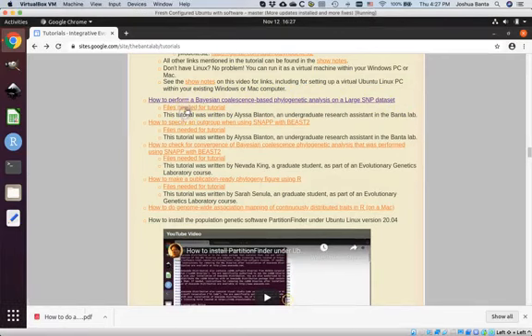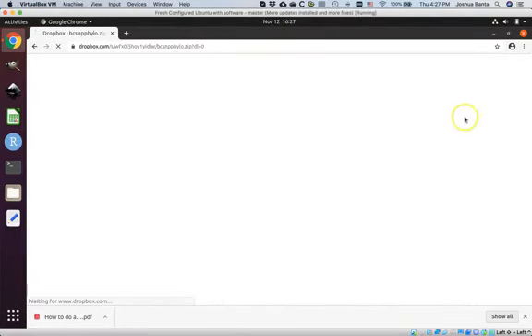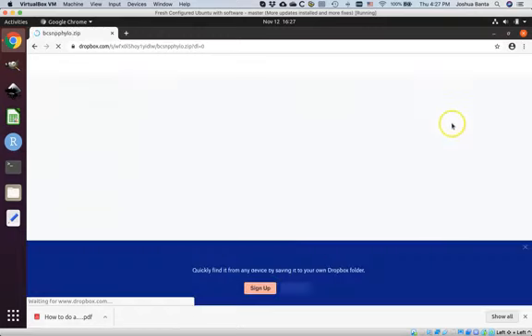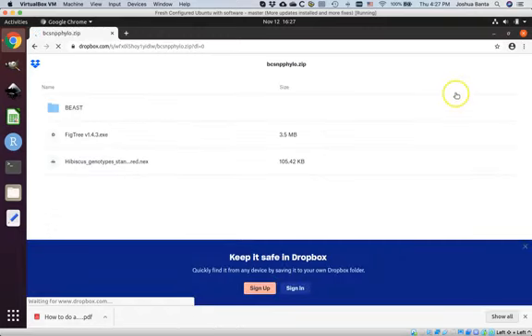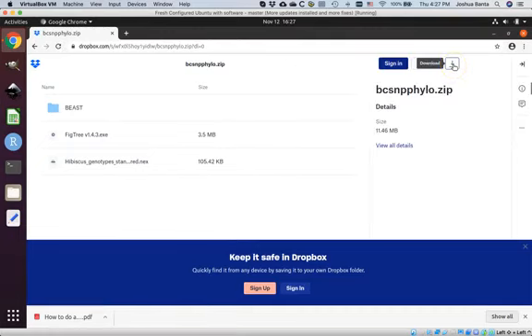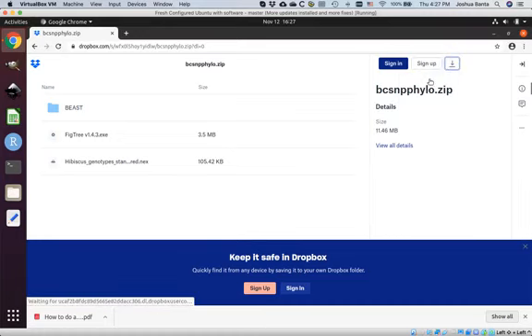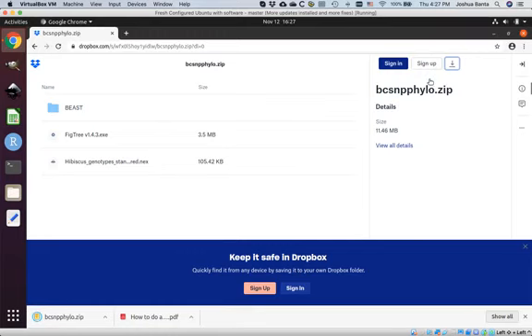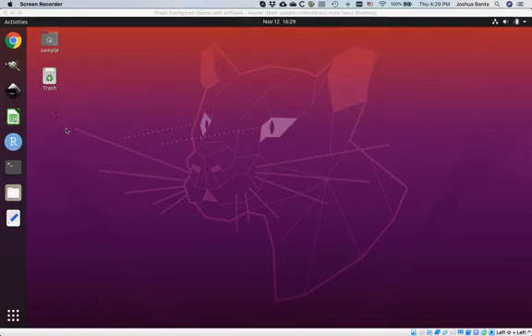This time, click on Files Needed for Tutorial. Wait for the page to finish loading and select Direct Download. When finished, as indicated, you may close the browser window. We need to put a folder on the desktop where we're going to unzip some files.